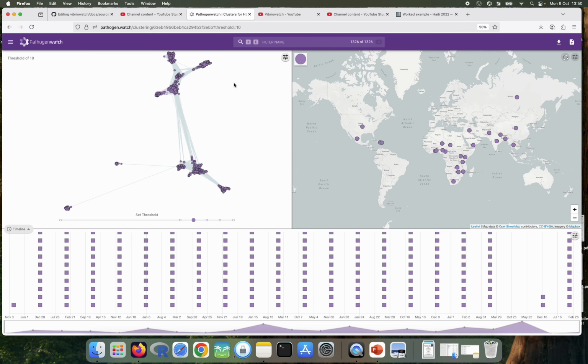On the top left, the cluster. On the top right, a map of where the isolates in the cluster were collected. And below, a timeline of when they were collected. As before, the H22 isolate is labelled, but I think you can only see 22 written. But what we can say is that this little blob contains H22 and its closest relatives.